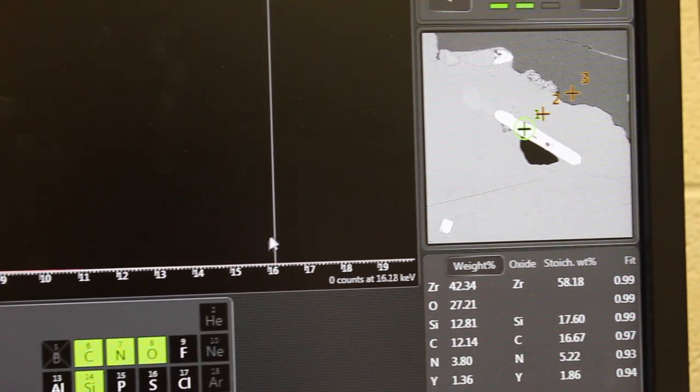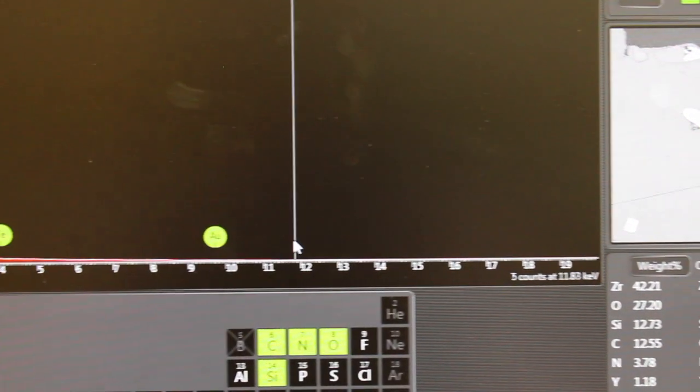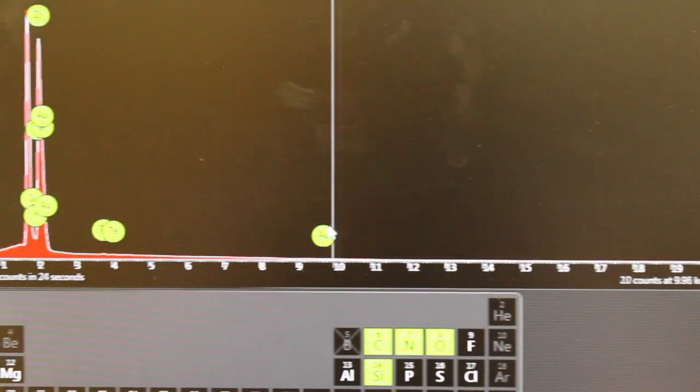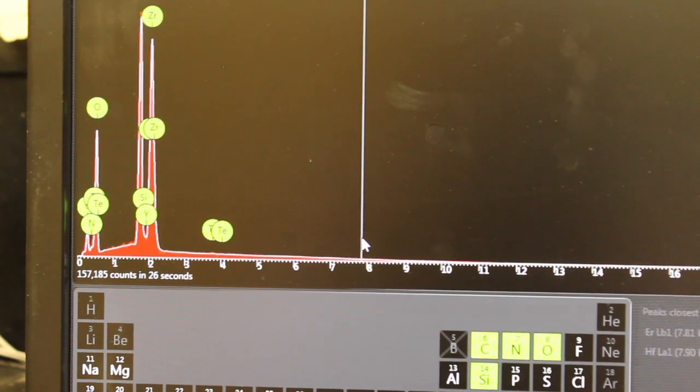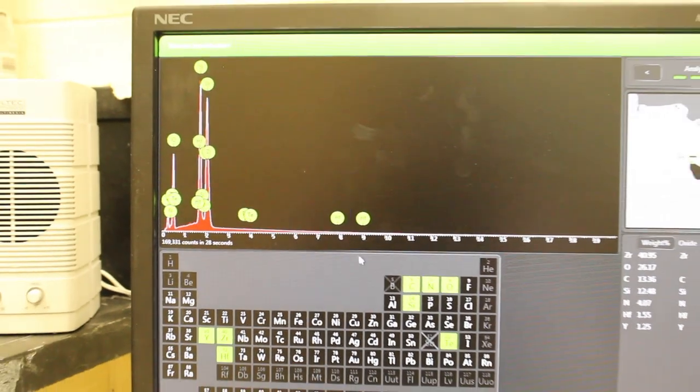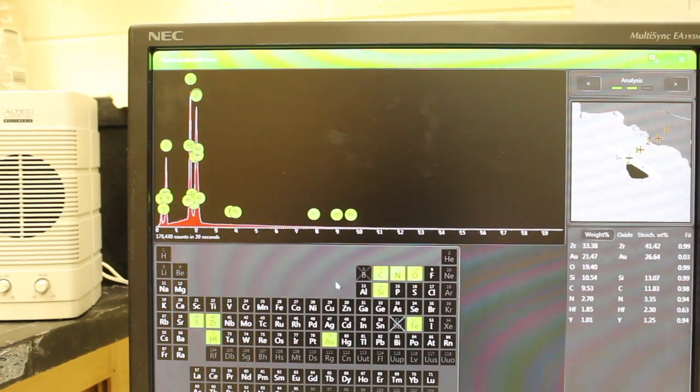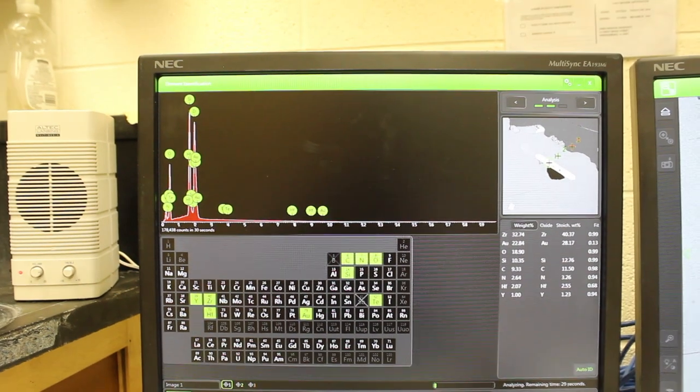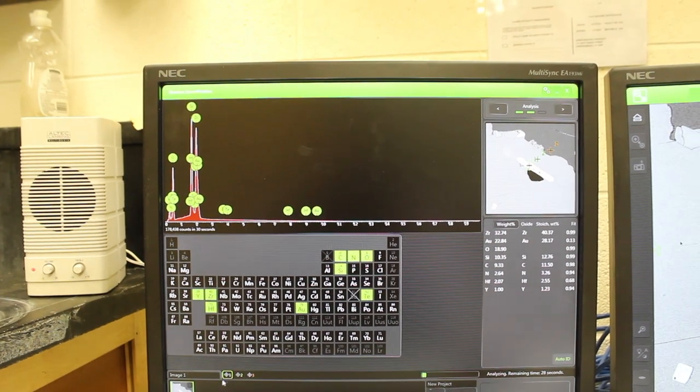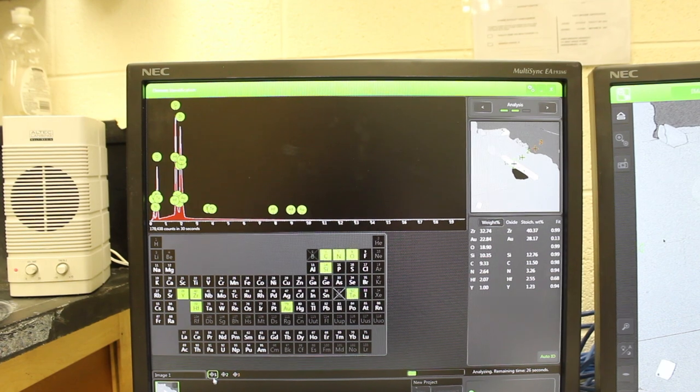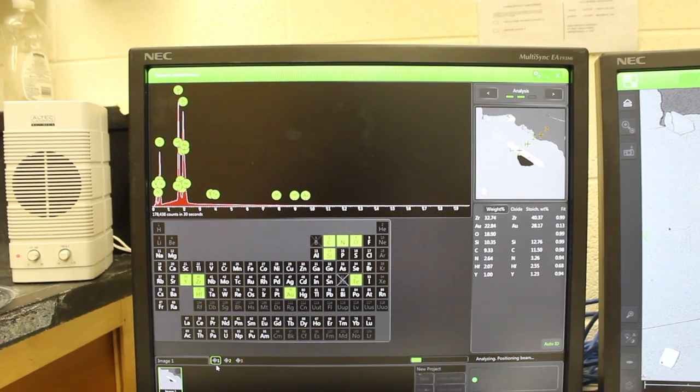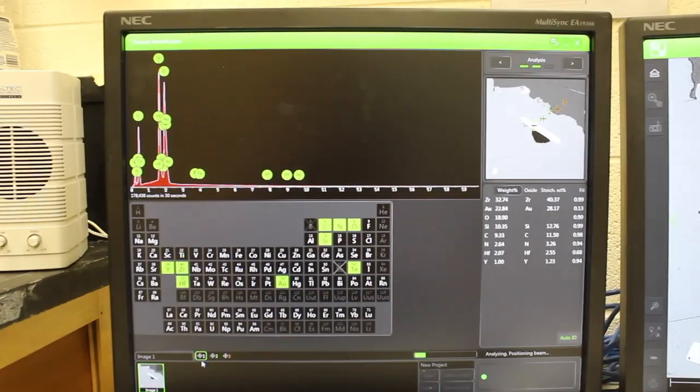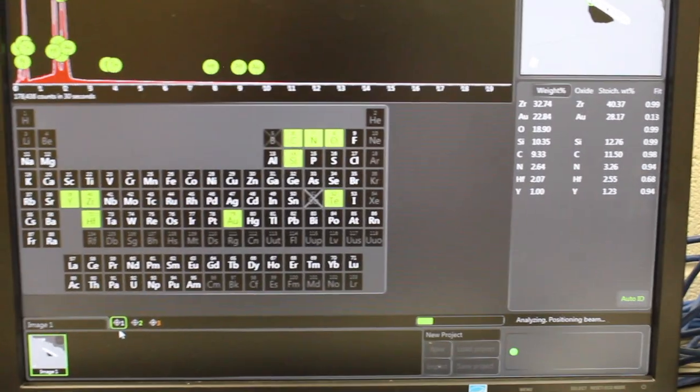So here we're seeing the data for the first analysis spot. I can tell that because if I look at the bottom down here I can actually see that number one is highlighted, so that's the first analysis spot down here.